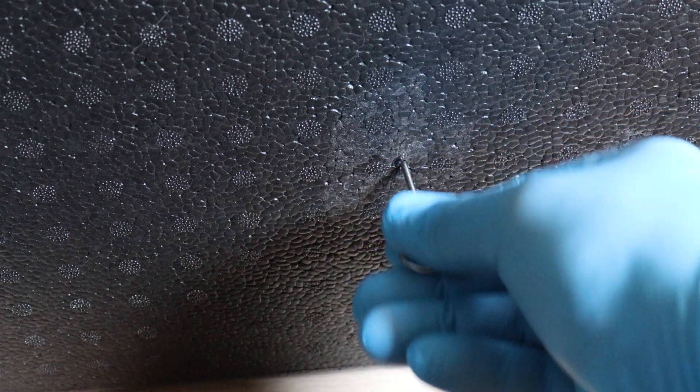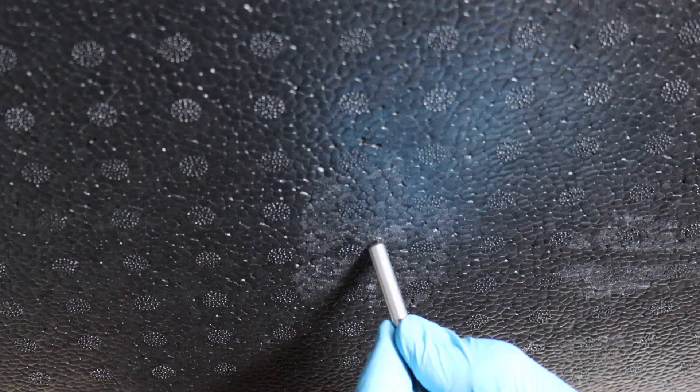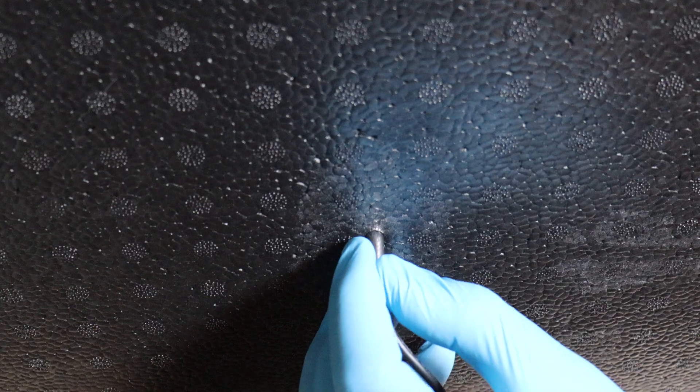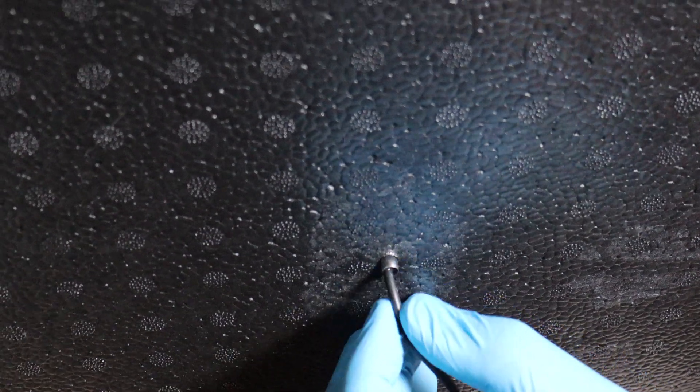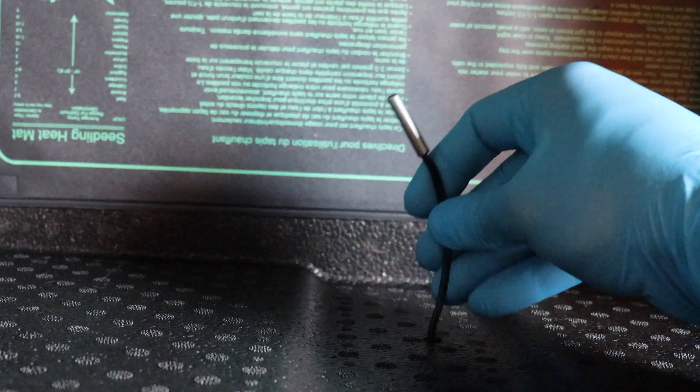Then take our skewer, make a hole in the side for our thermometer probe and in it goes. Easy as.